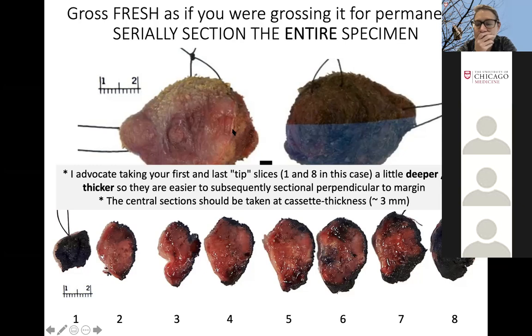Also for first years about the embedding, because I know we often did it with the prostates as well, with the apex and base, when you do perpendicular and then you want to embed on edge, you can make a note in Vantage, because sometimes the little pieces roll around in the cassettes and end up being embedded not the way that you put them in. So if you are really worried, take those 5 seconds to put that note in Vantage for histology.